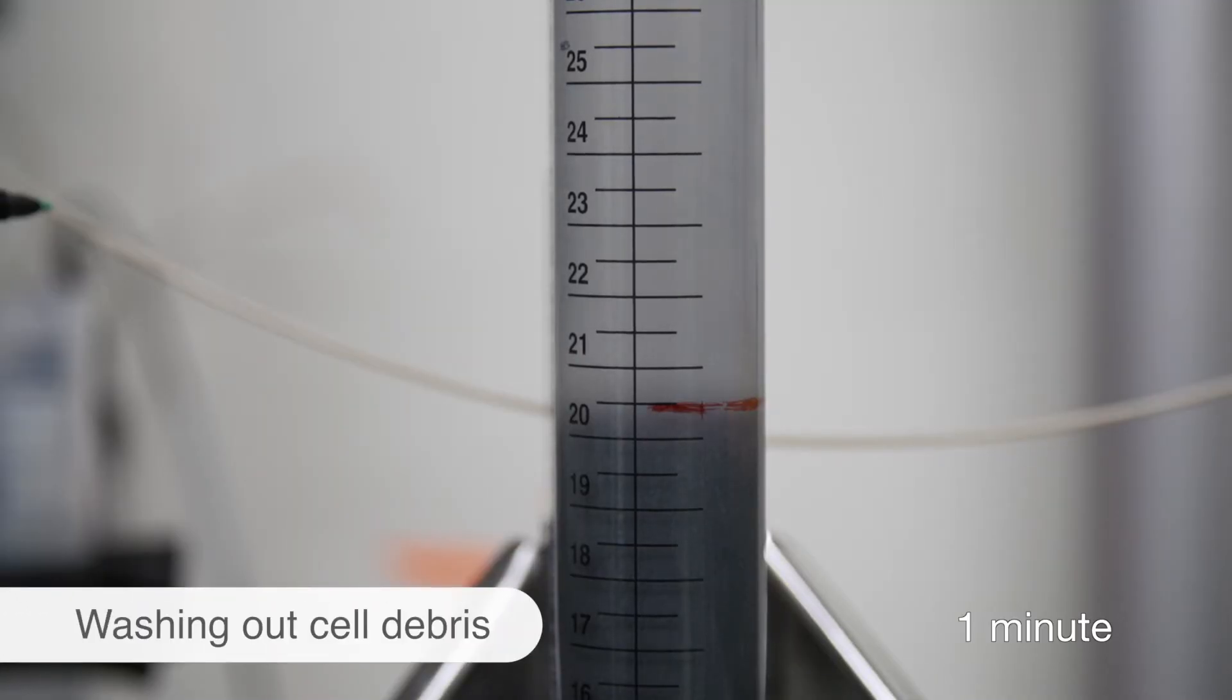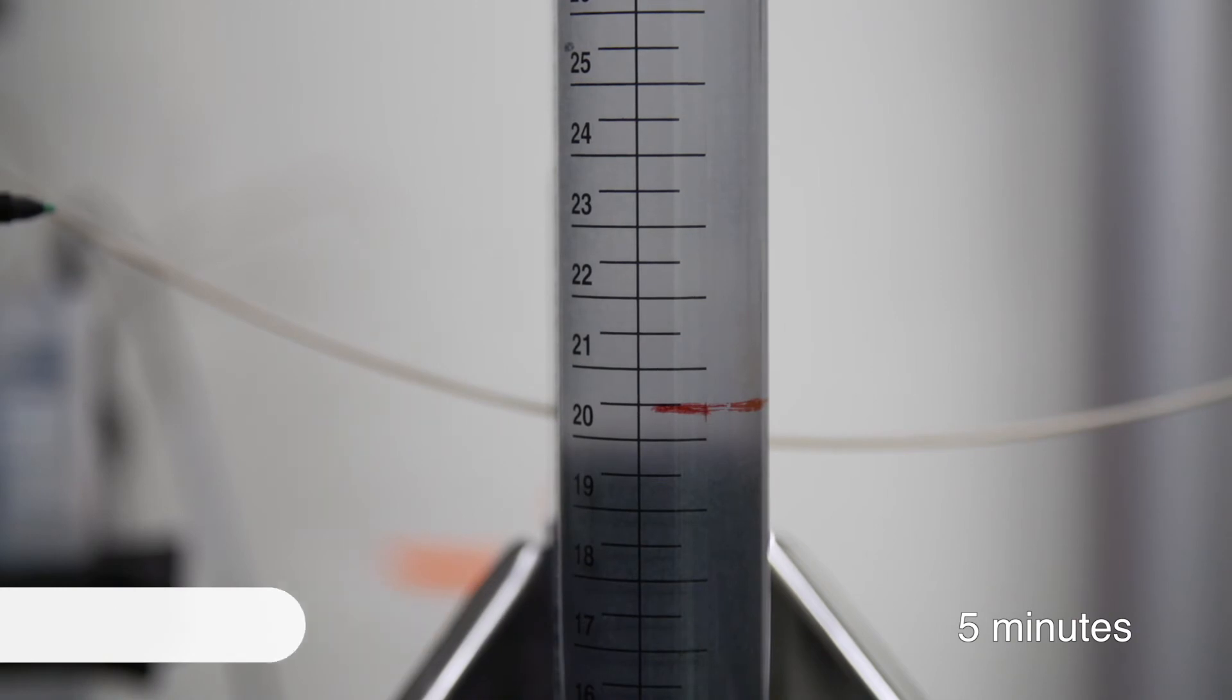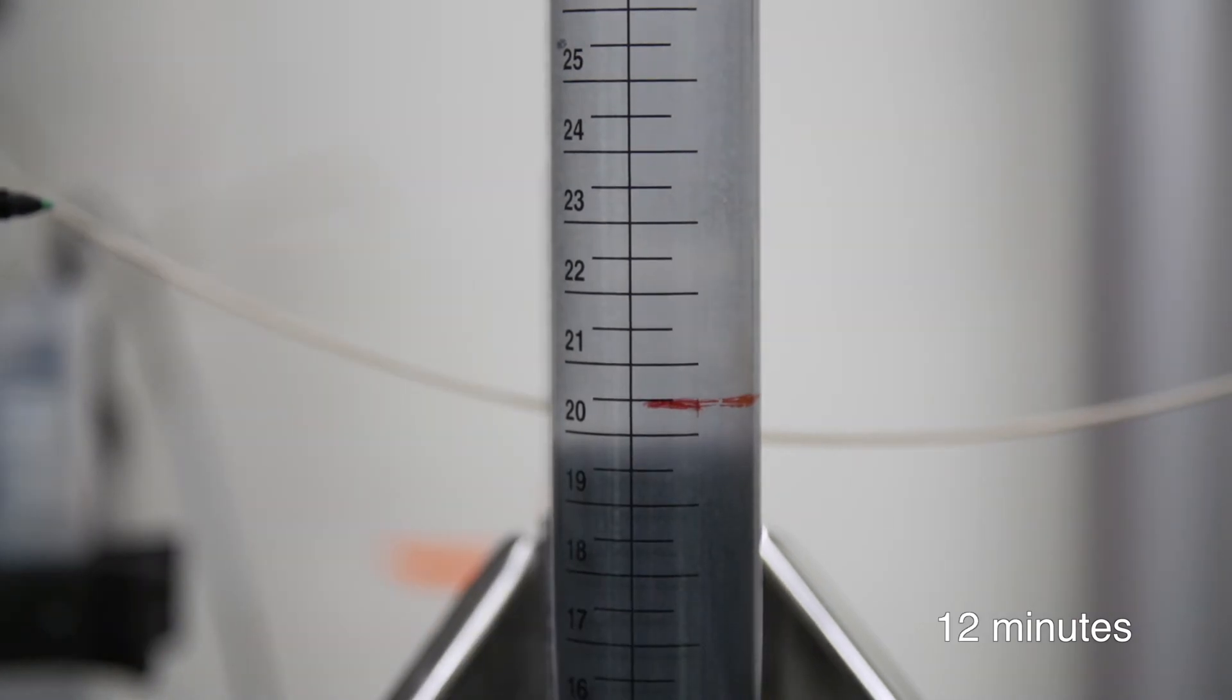The weakly bound materials such as residual cells, cell debris and other particulate materials are washed out from the expanded bed using a wash buffer.